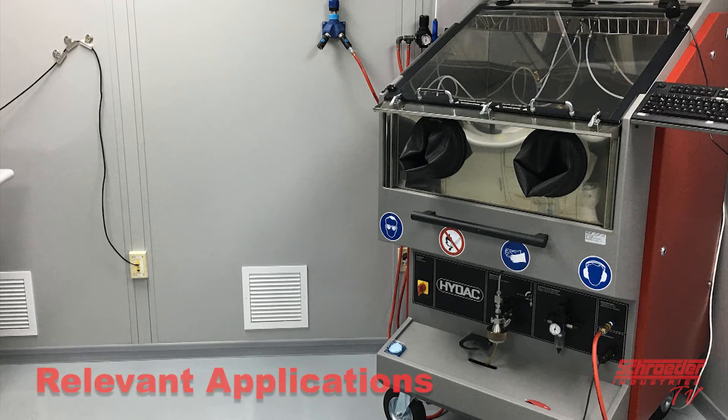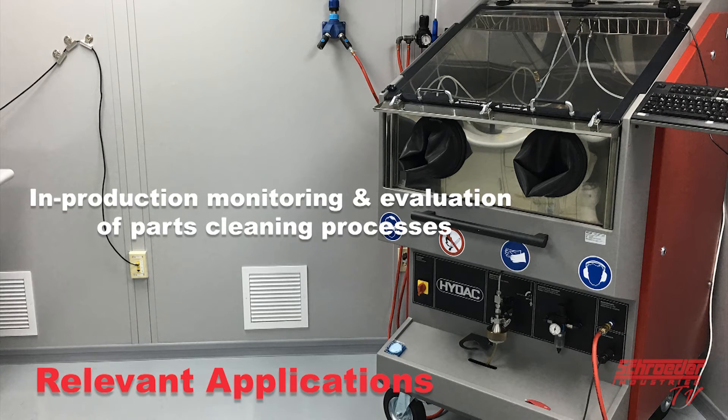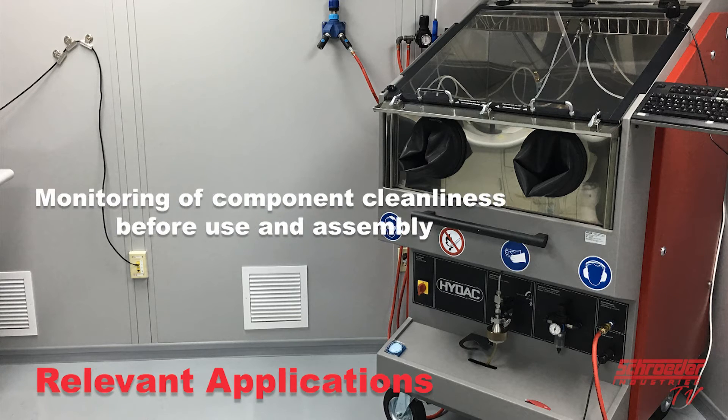The fields of application pertinent to the CTU processes are in-production monitoring and evaluation of parts cleaning processes, and monitoring of component cleanliness before use in assembly.